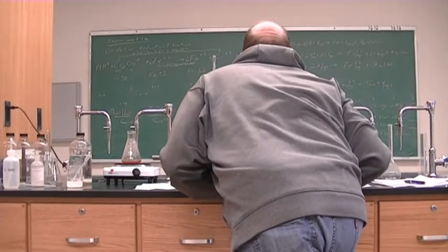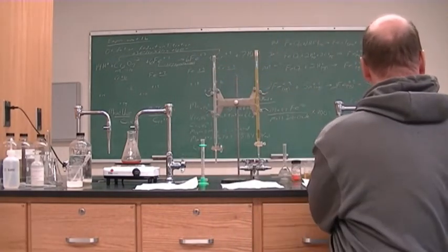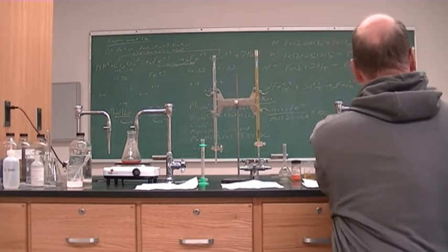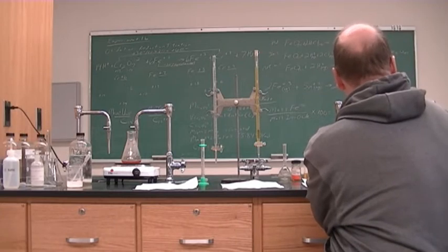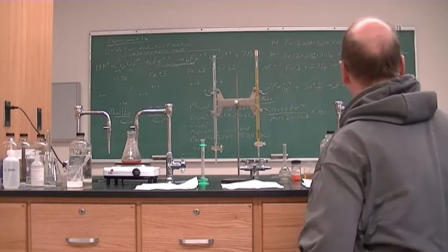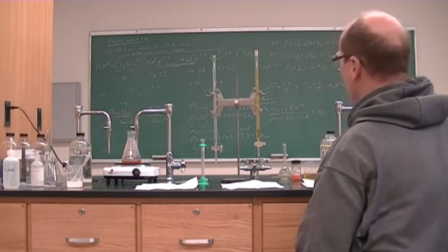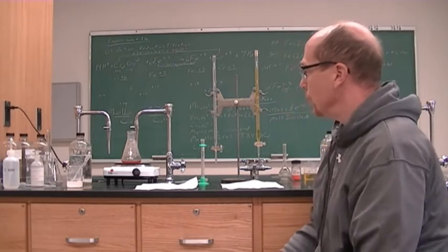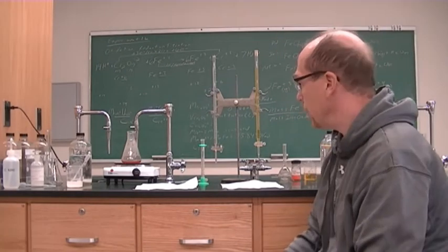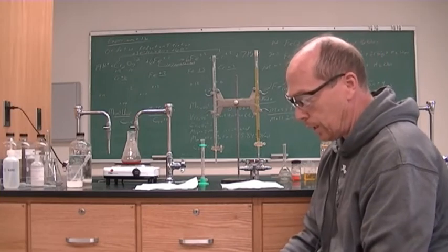The initial dichromate reading is 0.00. And so for run 3, again, we have 0.1150 grams of iron oxide number 51. And then the initial reading is 0.00 mL for our dichromate. All right, and so soon our iron oxide with hydrochloric acid is going to be boiling, and I will carefully swirl that.